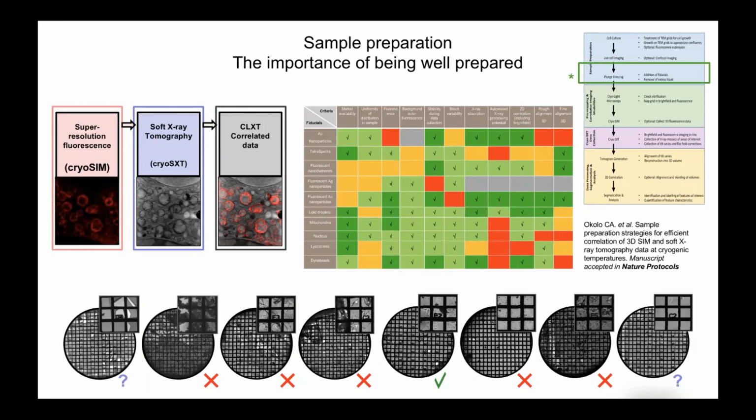So fluorescent nanoparticles are ideal, for example. We spend a lot of time building our experiments so the user at the end can have something that can easily be translated into actual real science results.